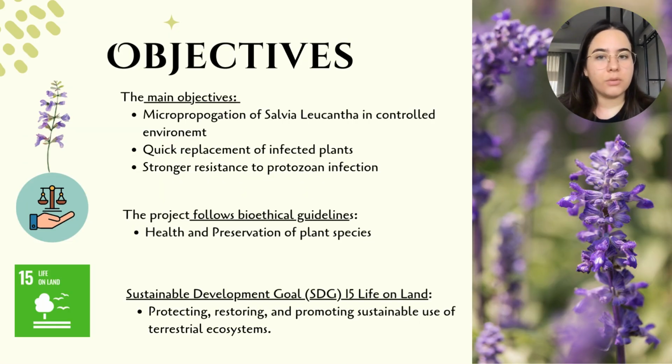Our solution to the challenge was mainly to find the quickest morphogenesis technique to micropropagate Salvia leucantha. This way we could make a plant bank of sorts, to be able to replace the sick or infected plant with a new plant every time we needed to.